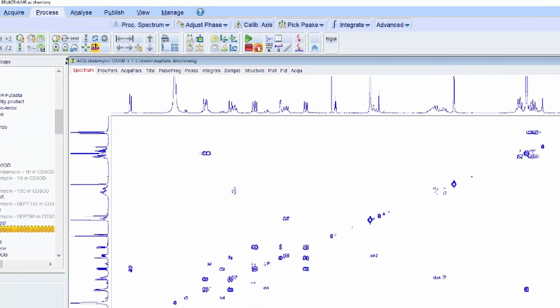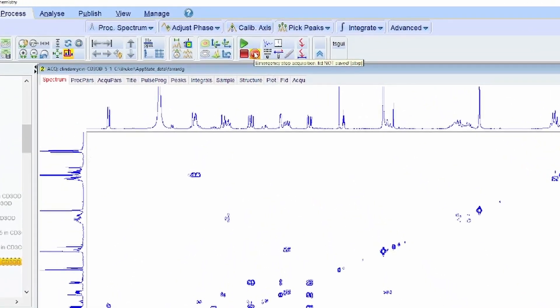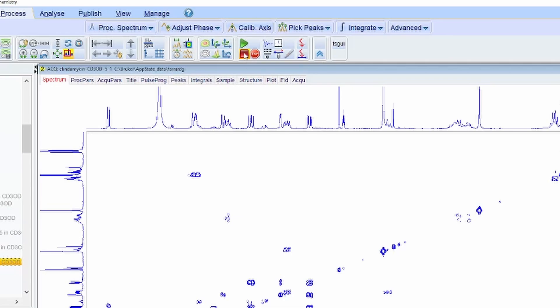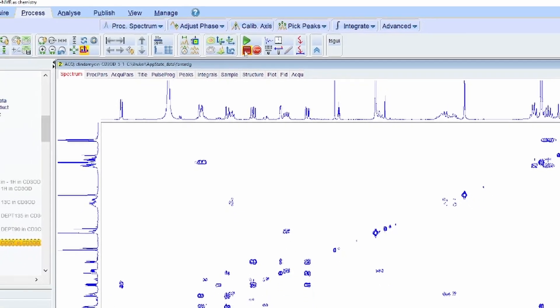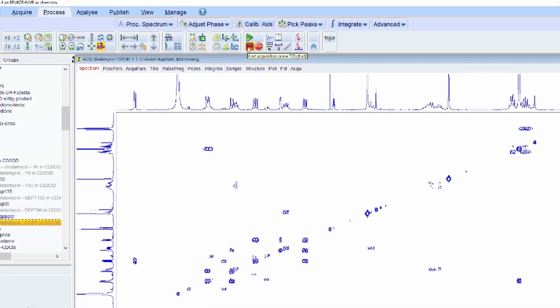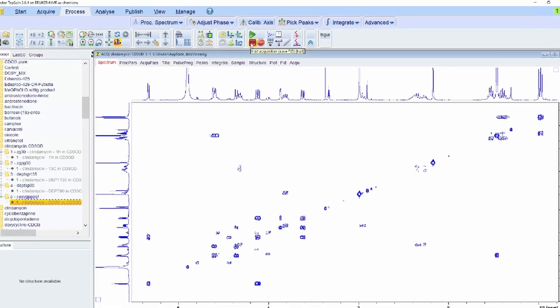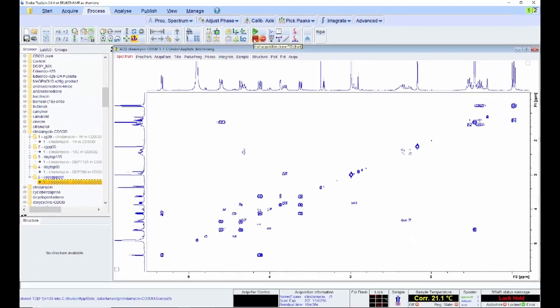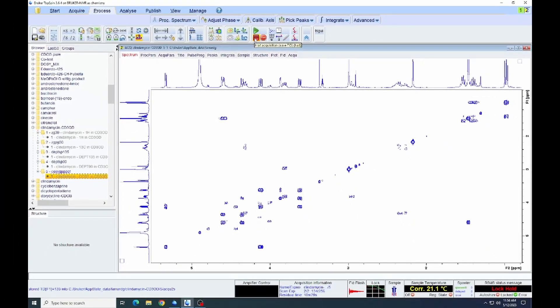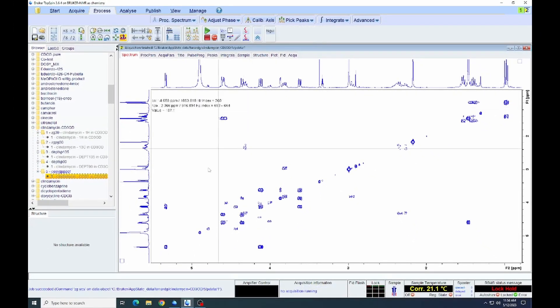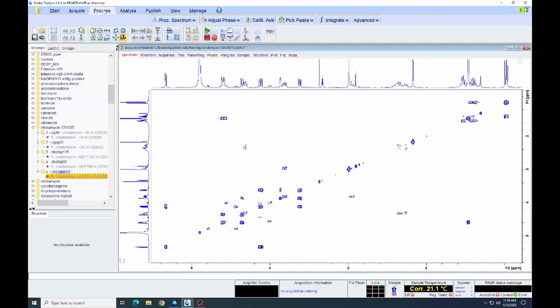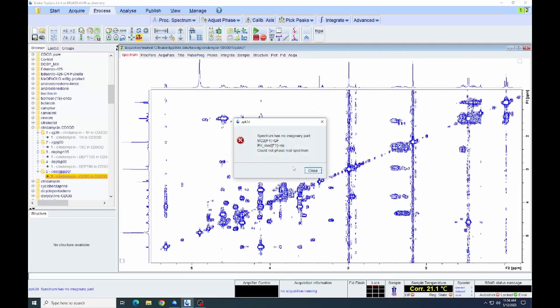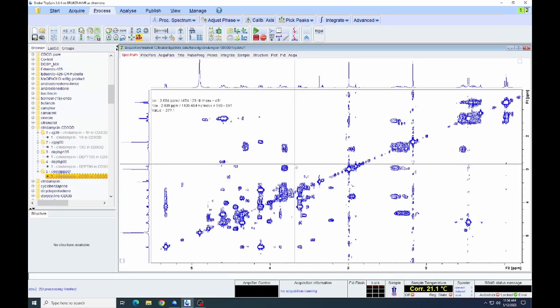This spectrum looks good enough. So we can halt the spectrum. Again, note that if we click on the stop button, it stops the acquisition but also does not save the data that we have collected. So we want to click the halt button. That stops the acquisition but saves the data that we have.